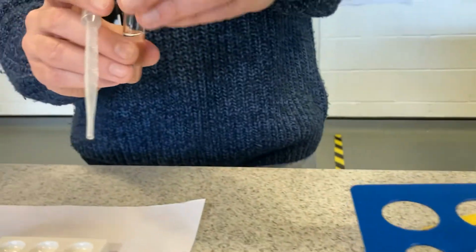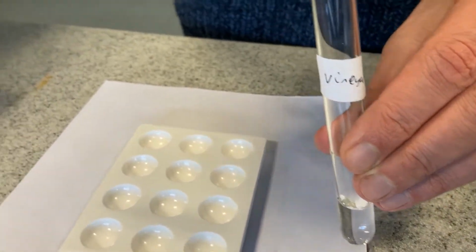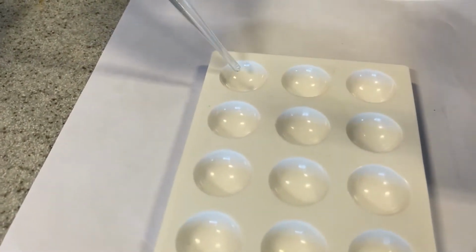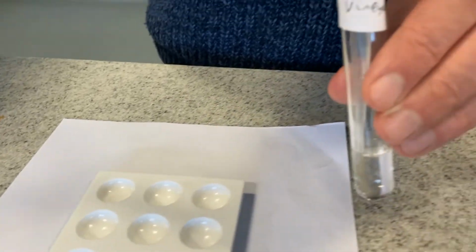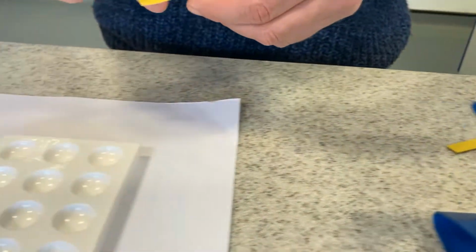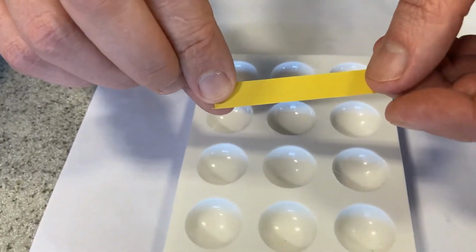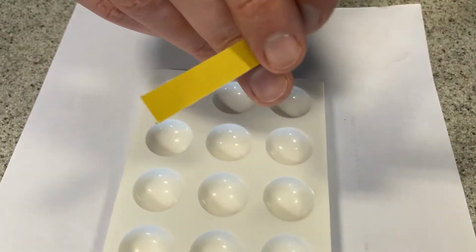So firstly, let's try the vinegar. So I'm going to do 1, 2, 3, I think that was 4 drops. 4 drops of vinegar, and this stuff here, this is called pH paper or universal indicator paper. This is the thing that's going to change colour.